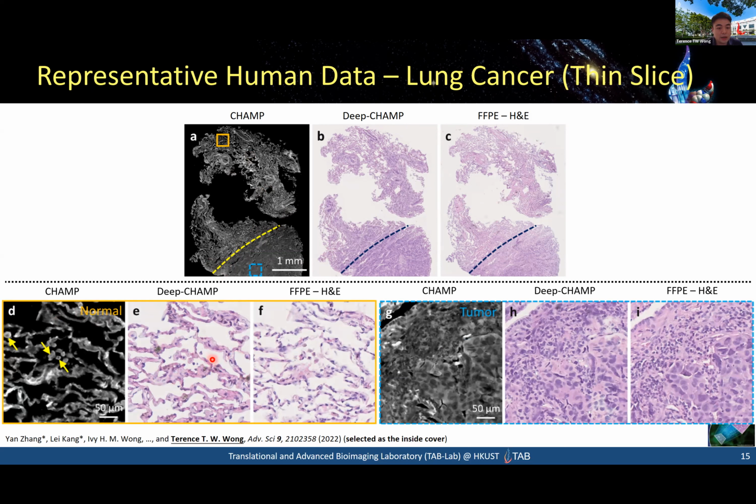Not to mention the cancerous region, like the large cell carcinoma, adenocarcinoma, can also be observed. Much larger cells in the middle and also the bottom right part, and the top left is smaller cells accordingly. So it's very useful for the pathologist to classify different grades of tumor, and also classify the subtypes of tumor by looking at this type of high quality histopathology images.